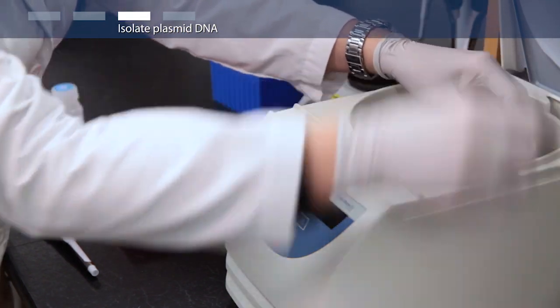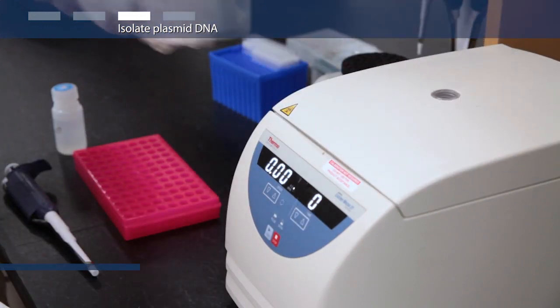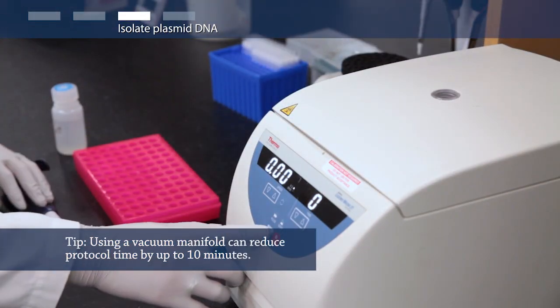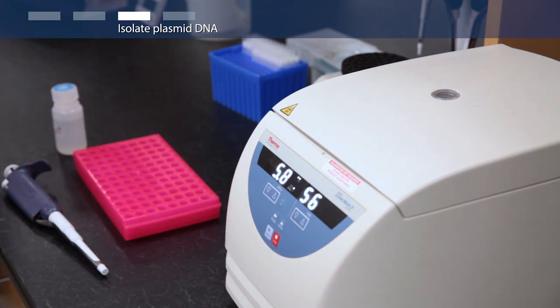Repeat the wash procedure using another 500 microliters of wash solution. Remove any residual wash solution by discarding the flow-through and centrifuging the empty column for an additional minute.